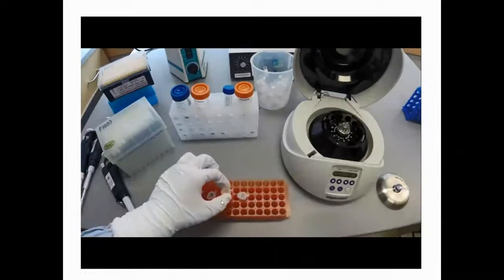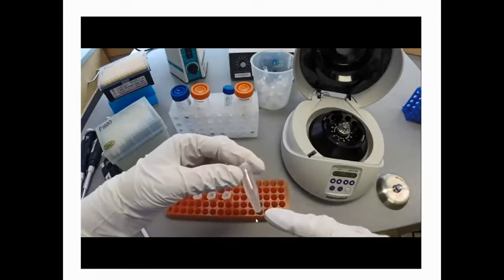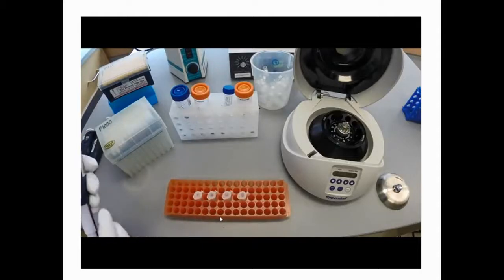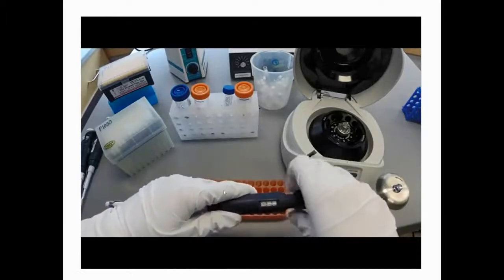In this example, a pellet is only seen in samples C and D, but all samples are carried through the process. Yeah, the pellet normally is very small and barely visible, okay? Using a P1000, slowly remove and discard approximately 800 microliters of supernatant.